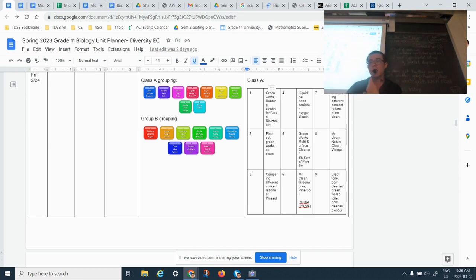So make sure you and your teammate know about it. And what you're going to do is talk about what you are going to do tomorrow, because you are going to have 2 or 3 plates, depending on whether you have a backup or not.